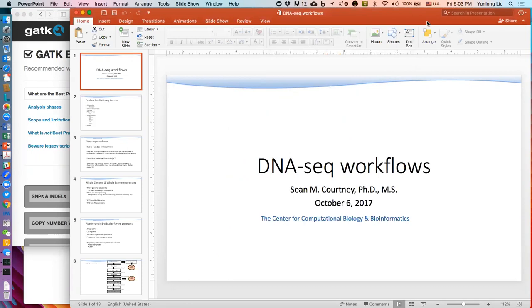Well, is everybody back? We ready to go? We're going to take a little different perspective on DNA sequencing. You've heard all of the background. You've heard about the alignments. You've heard about downstream analyses, annotations. My perspective today is I want to give you a hands-on tutorial for how to navigate some of the software that's out there, and also to show you how to navigate your homework.